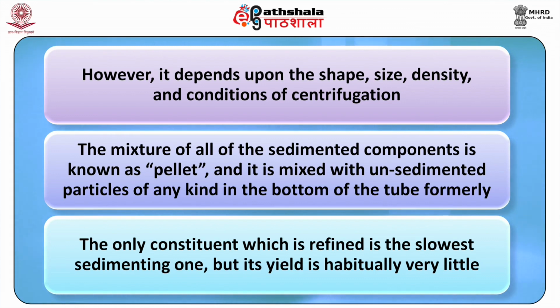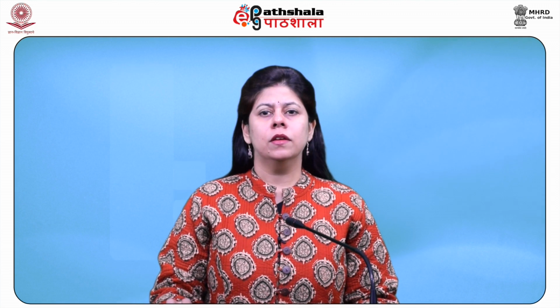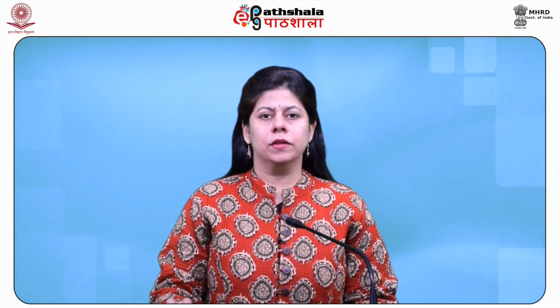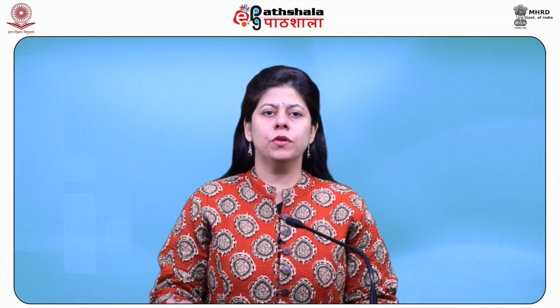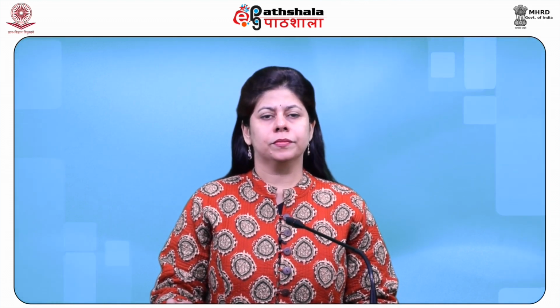The mixture of all of the sedimented components is known as pellet, and it is mixed with unsedimented particles of any kind in the bottom of the tube formerly. The only constituent which is purified is the slowest sedimenting one, but its yield is habitually very little. The two portions are recovered by transferring the supernatant solution from the pellet. The supernatant can be recentrifuged at greater speed to obtain extra purification with the formation of new pellet and supernatant.